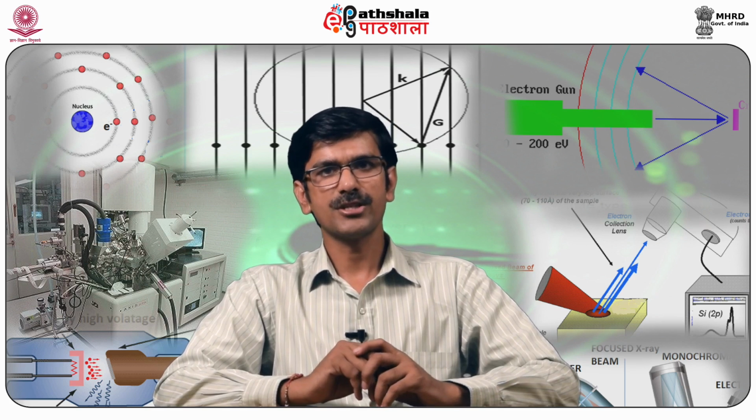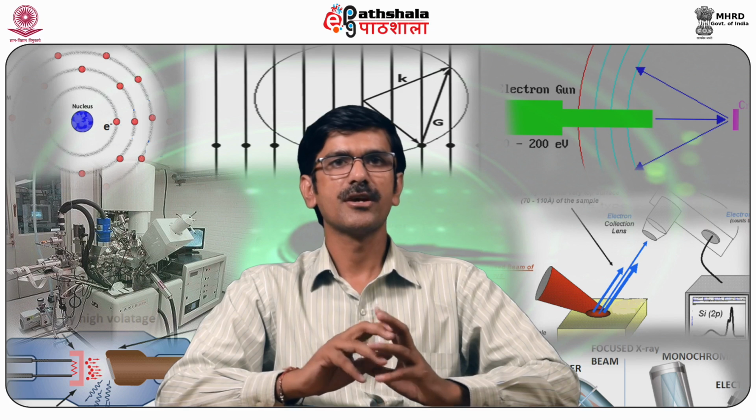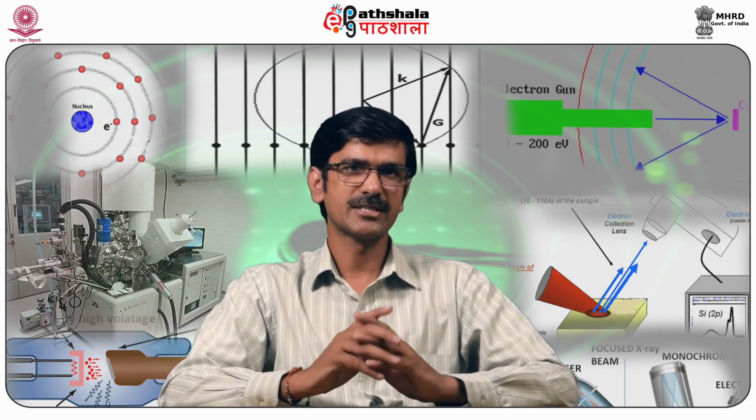Change in rotational, vibrational or electronic energy of a molecule can cause Raman scattering. If the scattering is elastic, the process is known as Rayleigh scattering.